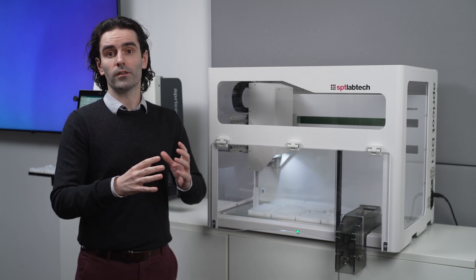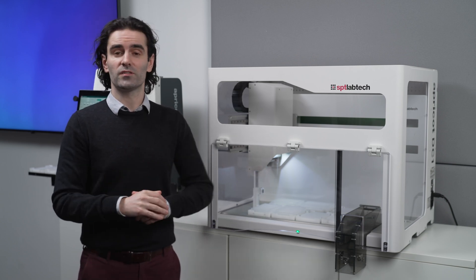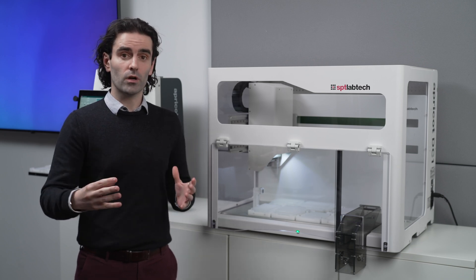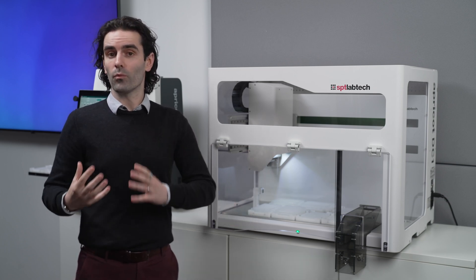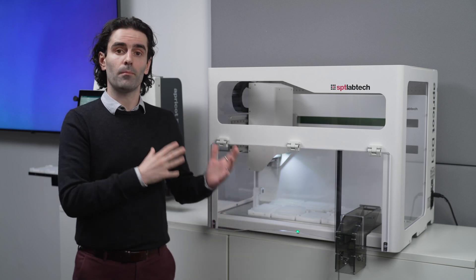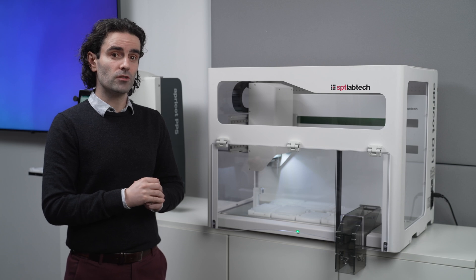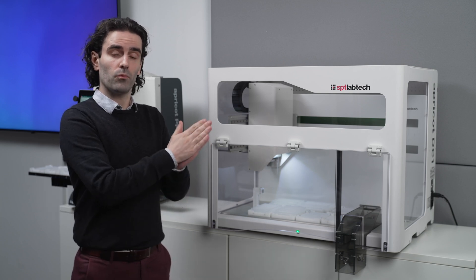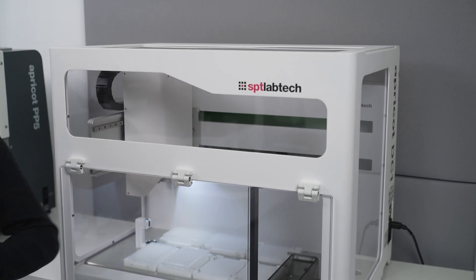On the deck of the DC1, you can have your plates in either landscape or portrait orientation, and the DC1 is capable of pipetting in single channel, 8 channel, or 12 channel — so it can work either by columns or by rows, as well as in single channel mode. The DC1 is really well suited for longer workflows where you need more deck positions and more walk away time. You can set up a workflow, leave, and come back when it's completed. Many customers use it for cherry picking applications in single channel mode, or for serial dilutions in either landscape with 8 channel mode or portrait with 12 channel mode.